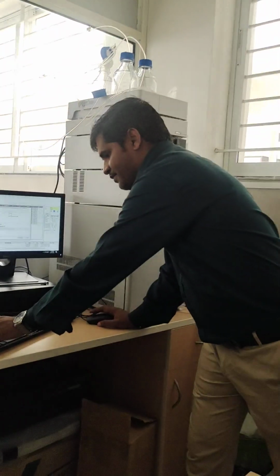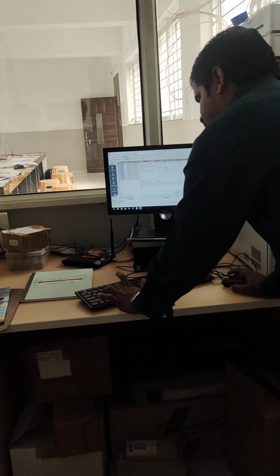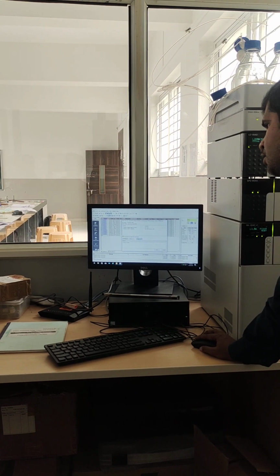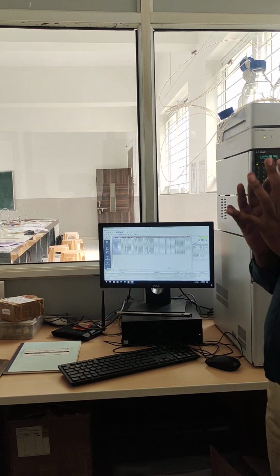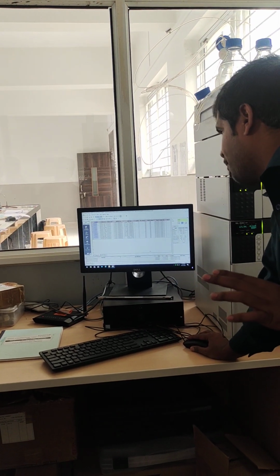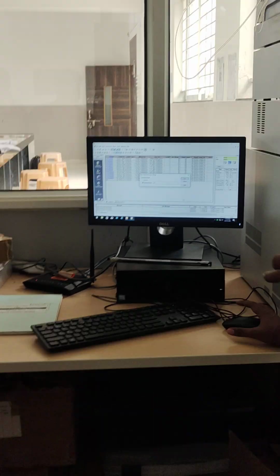One sample is added. Then apply to all and OK. Correct? So it is saved. Now I want to run directly. So the option is there, batch start. Which option is there? Batch start. So I will click on batch start.